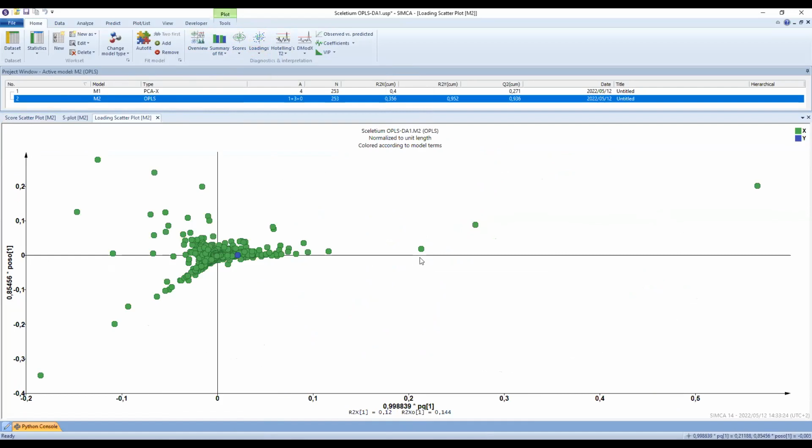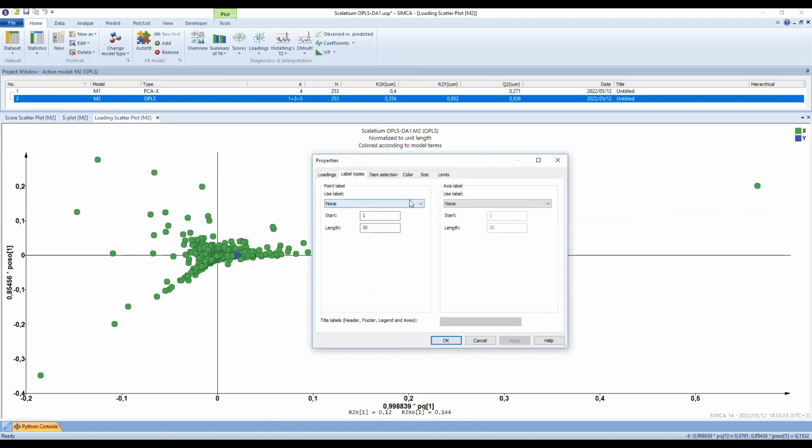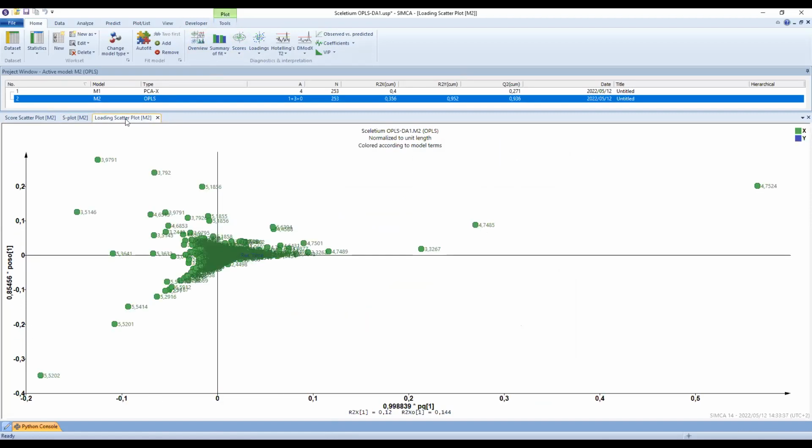In this case, it will give you exactly the same variables, but the S plot is just a nicer way of presenting your variables. I will show you now. You can still see those variables that are correlated to your green samples and then the one variable for the blue samples. But what you can't do is to present an S plot and then present a loadings plot, because they're saying exactly the same thing.